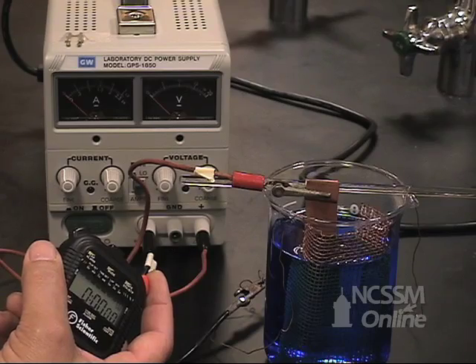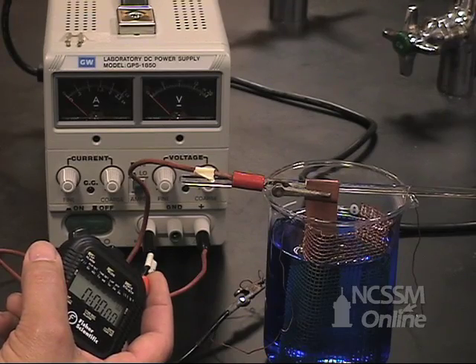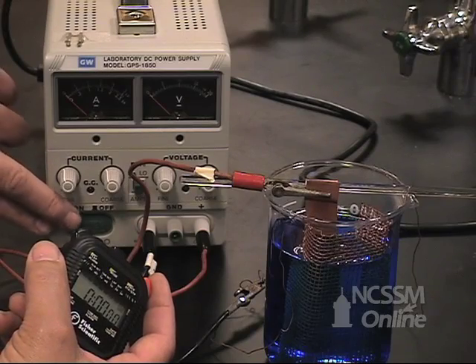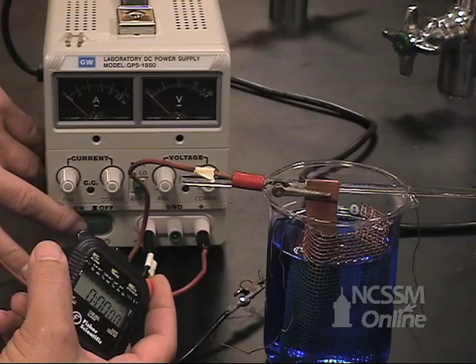We're going to need to time how long we've run the current through the cell. We'll use a stopwatch to tell us that. When we start the current, we'll start the time.